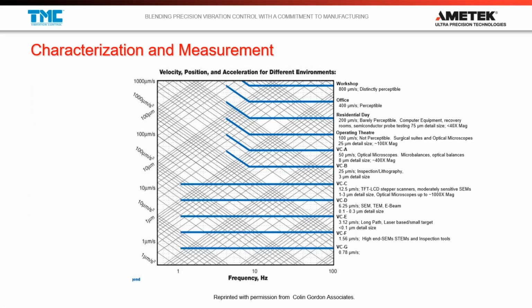And over time, we noticed this effect. Humans, engineers, architects, and people building tools started to realize they were sensitive to floor vibration. And we know floors can be noisy. As our instruments increase in sensitivity, it becomes more and more of a concern. And so over time, things became quite haphazard.